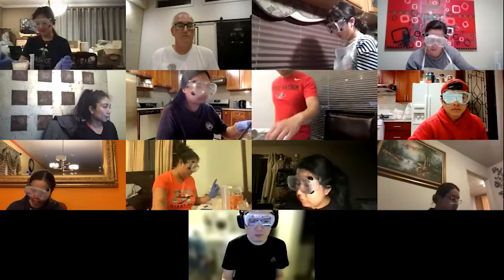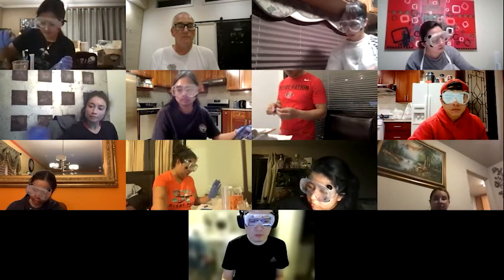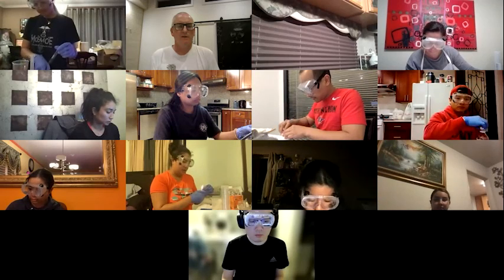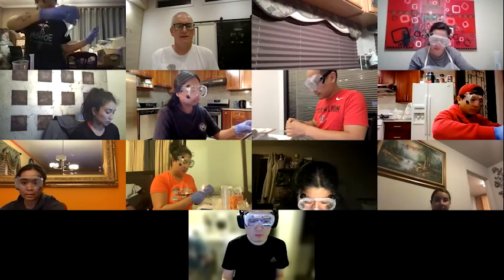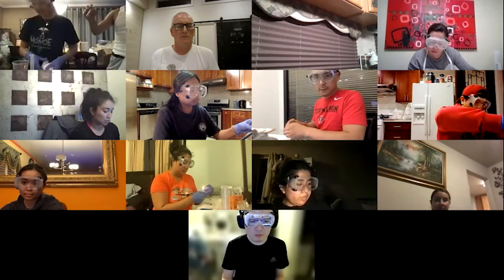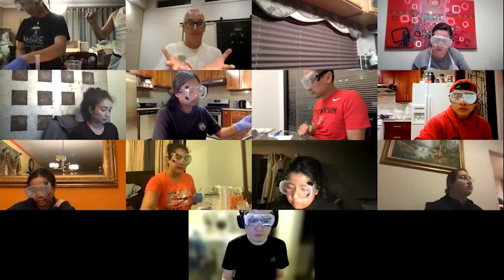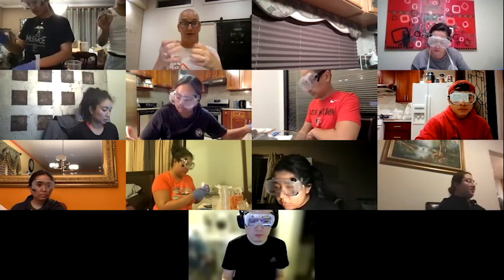So the glowing one and then the flaming one, is it supposed to create a larger flame, or is that one supposed to go out? Well, a flame's not going to go out in the presence of oxygen, right? Yeah, it should burn a little more intensely, if anything. But the real test is, can it reignite something? When it's glowing, it's still burning, just at a very low level. And so basically it's another kinetic reaction where you increase the concentration of oxygen and it speeds up the reaction. So it goes from burning a little bit to burning a lot.